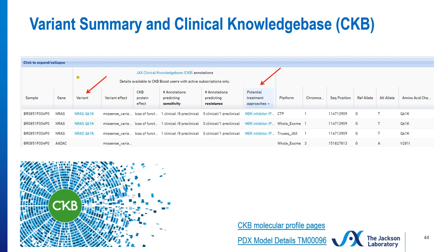We also have information available that can be quite helpful as part of the variant summary and the JAX Clinical Knowledge Base, or CKB. And so what we can see is information about the variant effect, a predicted protein effect, as well as annotations regarding predicted sensitivity or predicted drug resistance. There may also be information regarding potential treatment approaches, in addition to platform used to assess the variant, and information about amino acid changes, et cetera.